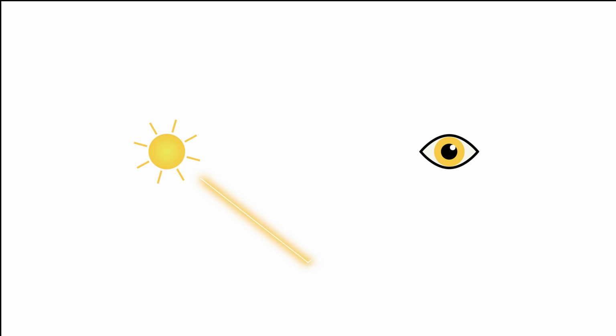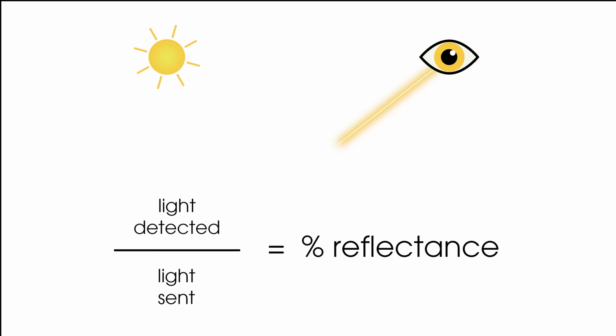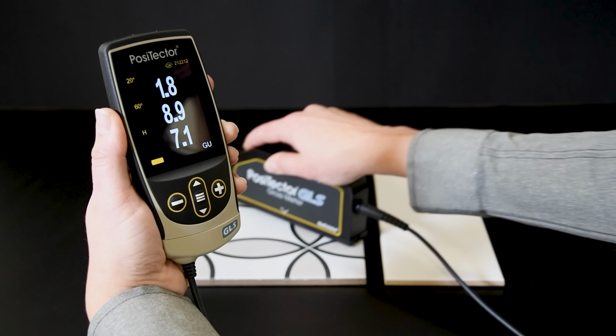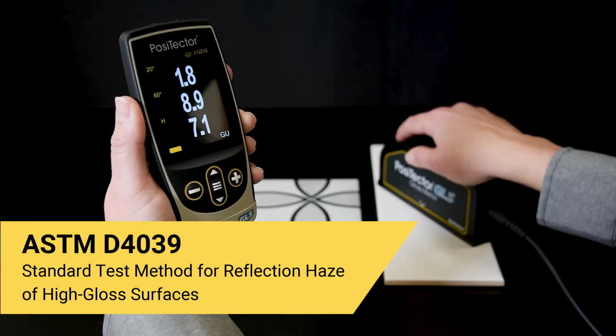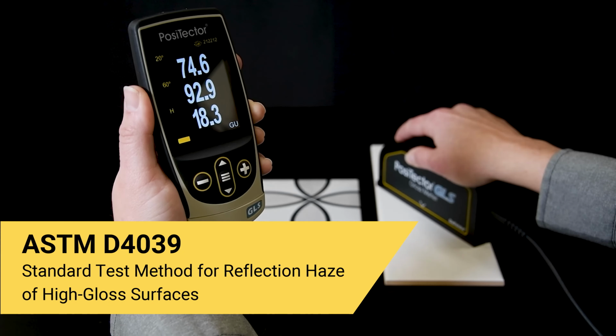Reflectance is a measurement of the amount of light detected versus the amount of light sent and is expressed as a percentage. Haze is the appearance of a milky halo or bloom perceived in reflective surfaces due to microscopic imperfections. The Haze Index is measured according to ASTM D4039 by subtracting the 20-degree from the 60-degree specular gloss measurements.